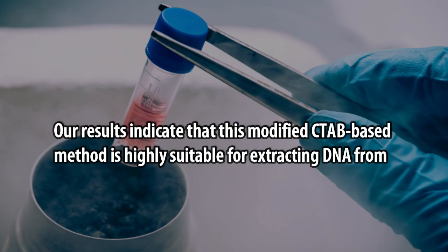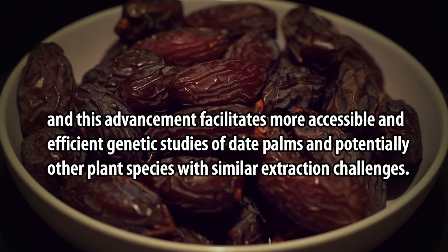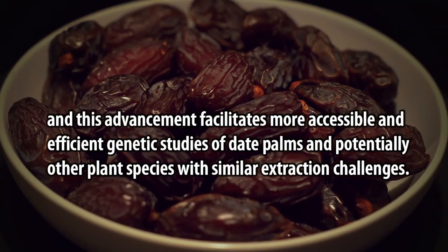Our results indicate that this modified CTAB-based method is highly suitable for extracting DNA from date palm tissues without the need for liquid nitrogen, providing a simplified and effective approach for molecular biology applications in date palm research. This advancement facilitates more accessible and efficient genetic studies of date palms and potentially other plant species with similar extraction challenges.